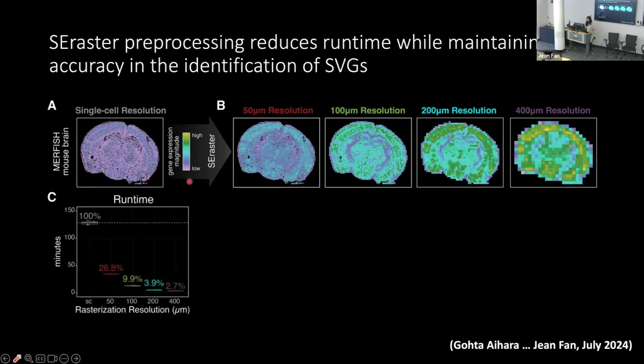And in this case, as you might expect, when I aggregate, I'm essentially downsampling. I'm reducing the number of spatial positions I have to consider rather than looking at SVGs at a single cell resolution. I can plug this into nnSVG. I can plug this into our package MERINGUE. We can do CRAWDAD analysis on the pixel level and look for spatially variable genes across pixels. And because there are so many fewer pixels, that just drastically decreases our runtime and also decreases the memory necessary.